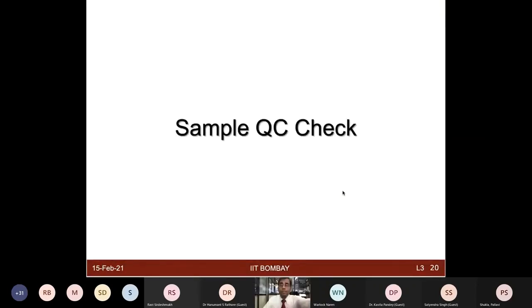All right, so once we know that we got good yield of protein and we have sufficient amount of protein from the given sample, then we would like to check the quality, how good the quality of the protein is on the SDS-PAGE gel. And many times you might feel that from the quantification you have very high values and you think you got very good yield, but actually in reality you may not have so good a yield. We will talk more about SDS-PAGE and gels tomorrow, but I'll just show this lab demo now about how to check the quality of your samples on SDS-PAGE gel.